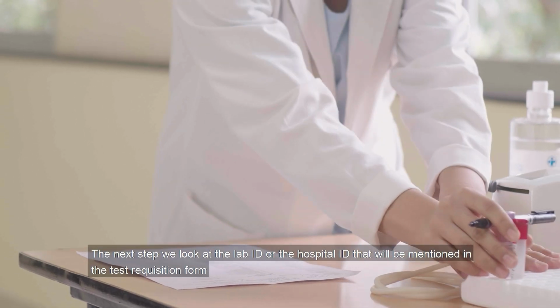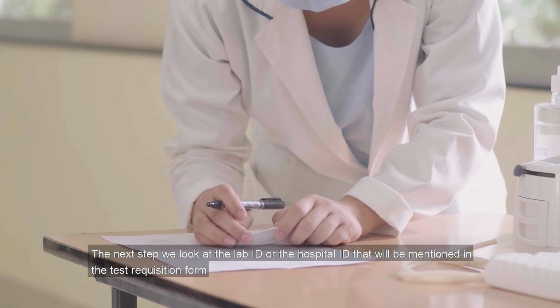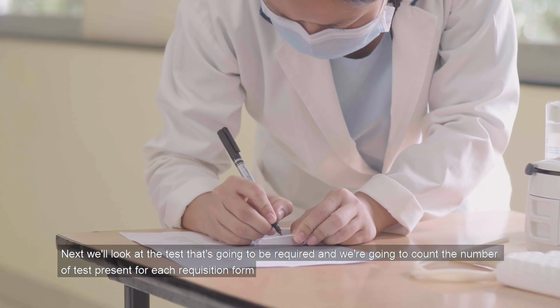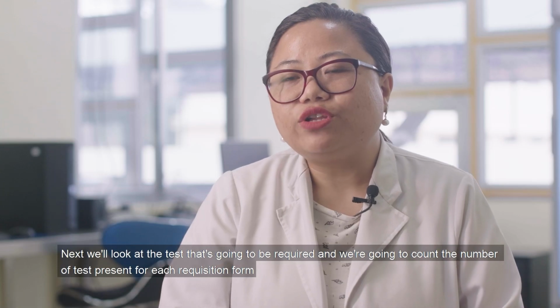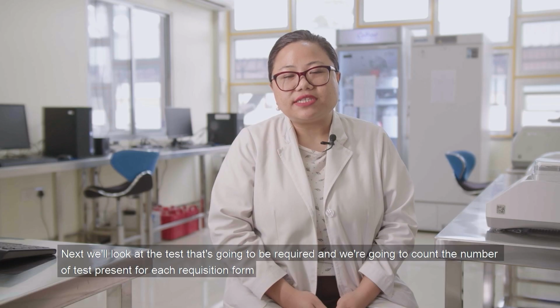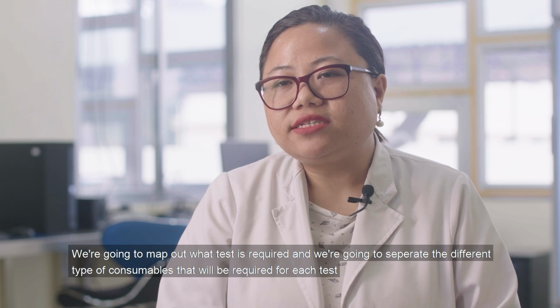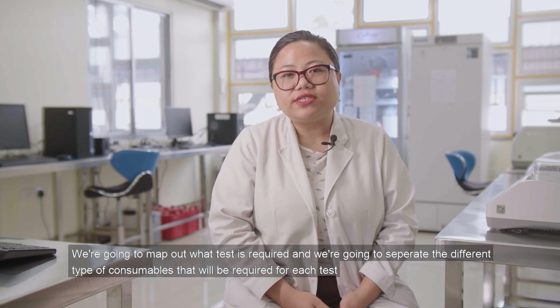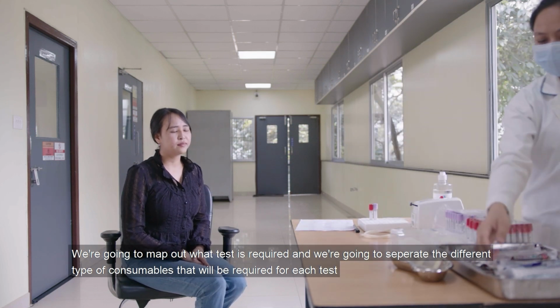The next step, we look at the lab ID or the hospital ID that will be mentioned in the test requisition form. Next, we'll look at the tests that are going to be required and we're going to count the number of tests present for each requisition form. We're going to map out what tests are required, and we are going to separate the different types of consumables that will be required for each test.